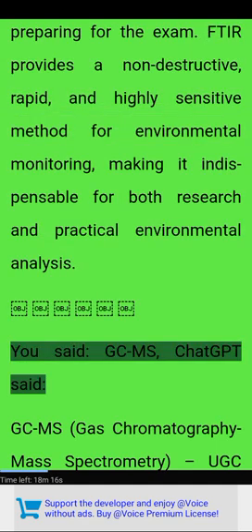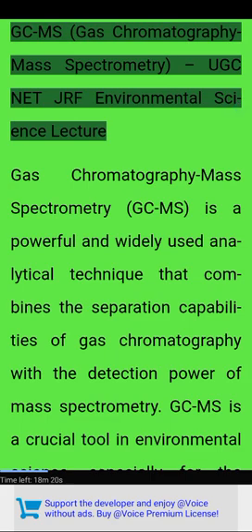GCMS, gas chromatography mass spectrometry, UGC NET JRF environmental science lecture.